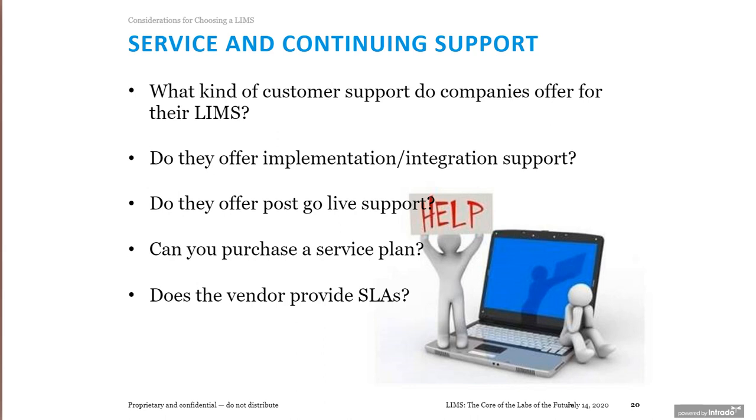Service and continuous support. What kind of customer support does this company offer for their LIMS? Am I going to have support during the journey of implementing a laboratory information management system? Am I going to have post-go-live support? Can I purchase a service plan?